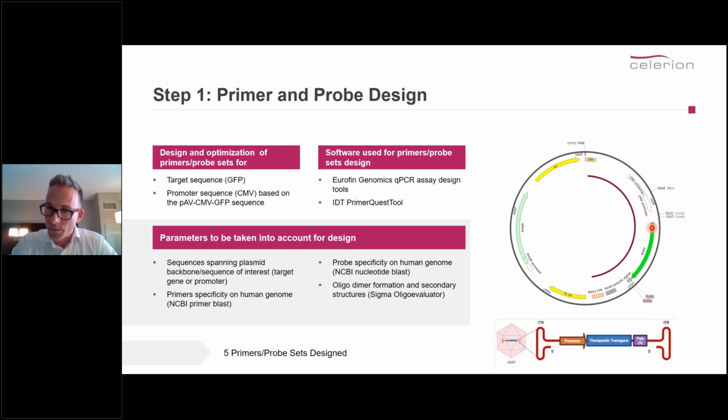And again, you will be focusing on the very small region where you think you'll have a suitable sequence region. So again, it's important to narrow it down, to focus on it, and to make sure as well, once you have designed primers and probes, that there's many tools out there you can use online, or also your PCR software might have a module in there to do that.